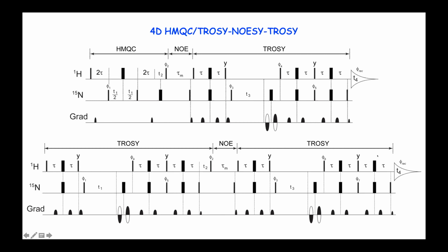So when you do this, you make sure that the direct dimension, the x-axis in NMRPipe, is T4, then you apply echo anti-echo. And then when you do the indirect dimension, you make sure that you transpose the data set so that T2, F2 is your current x-axis, and then you apply echo anti-echo to the T1 dimension, and you'll be okay, all right?